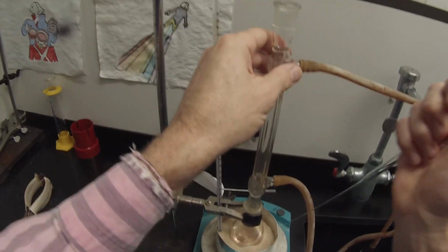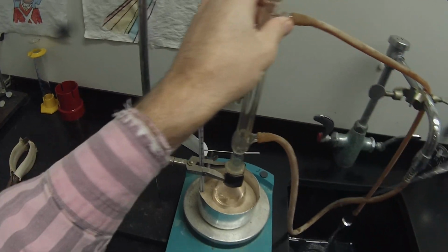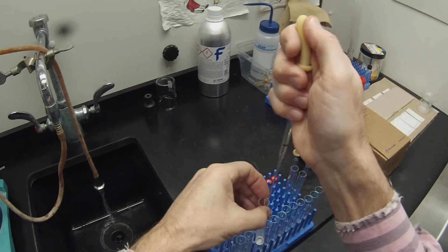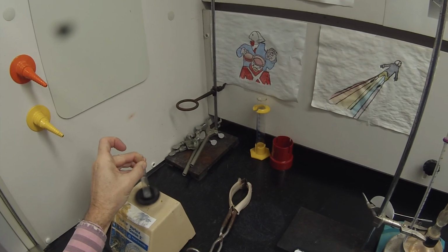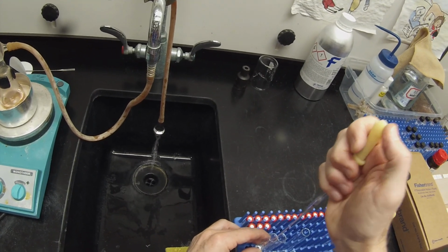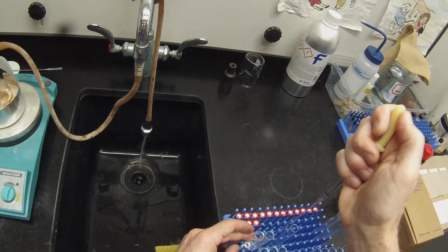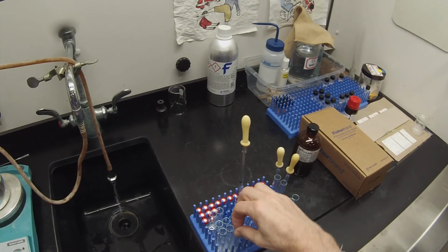So we're at 2 minutes and 56. I'm going to go in there and get my time equals 3. And then we'll vortex that. And rinse our pipette. And a half milliliter or so of dichloromethane. Oops. Accidentally squirted that back in. There's not going to be very much carryover, and we don't have to worry too much about that.